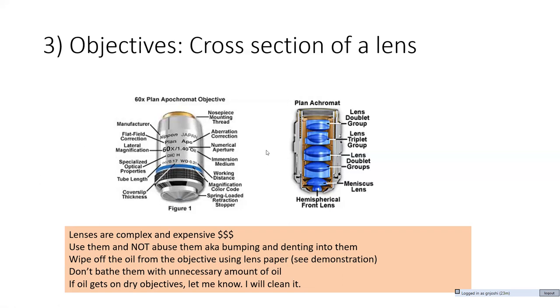And if by mistake the oil ends up getting onto an air objective, let me know. I'll clean that up. All right. So it's not a big deal. So one question here regarding this working distance.